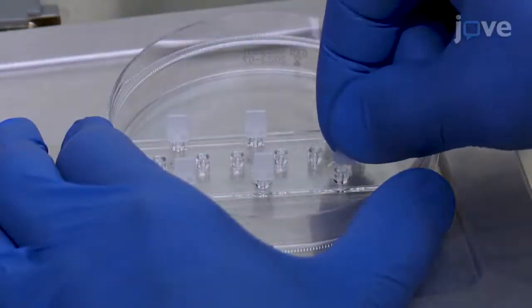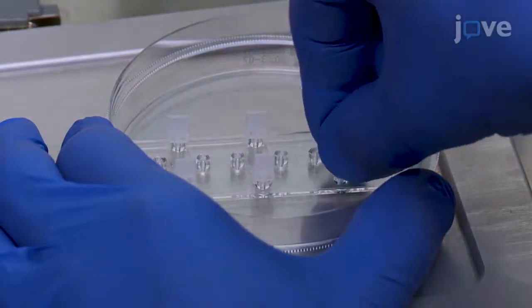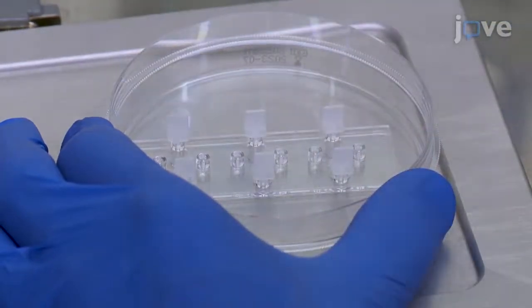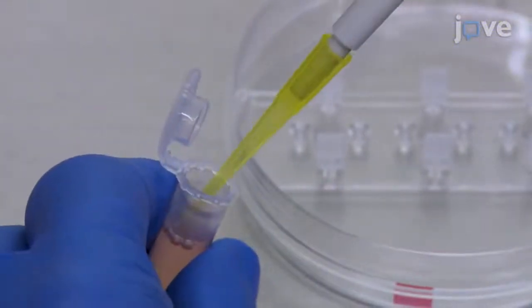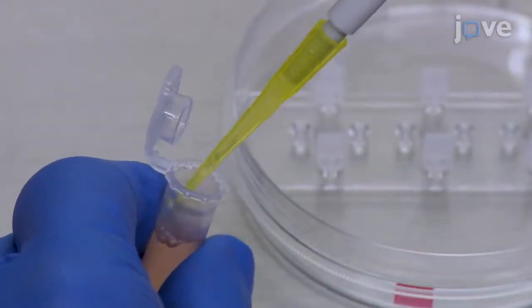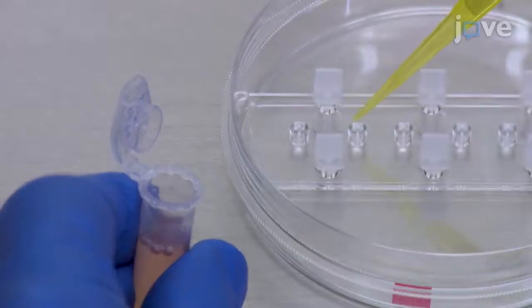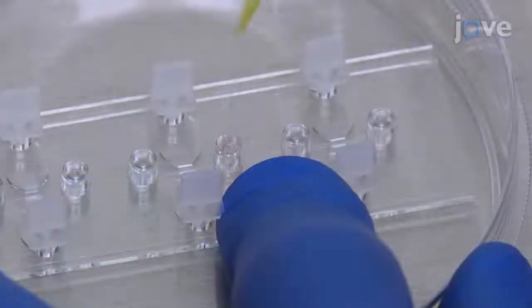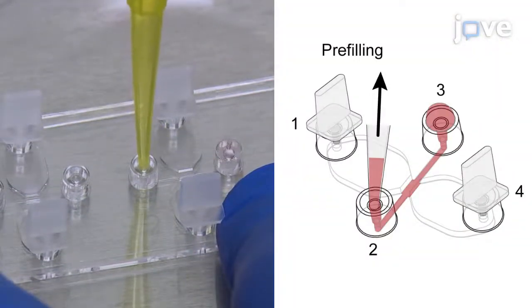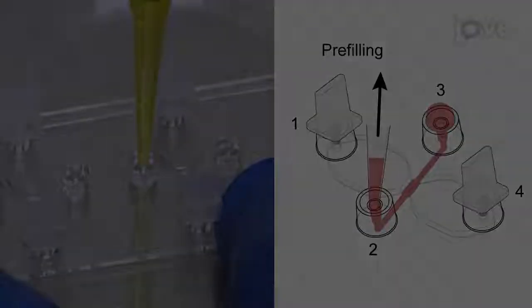Then insert plugs into ports one and four. Use a 200 microliter beveled pipette tip to deposit 15 microliters of the modified RPMI 1640 Hippies medium into filling port 3. Next, insert the pipette tip into port 2 and aspirate 15 microliters at a moderately fast rate.